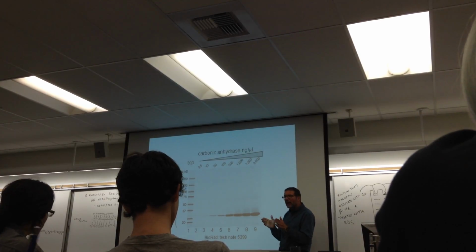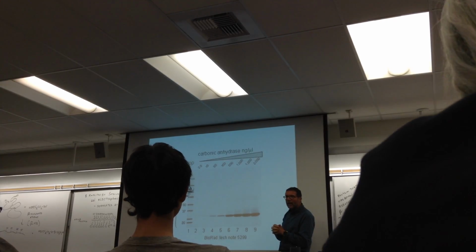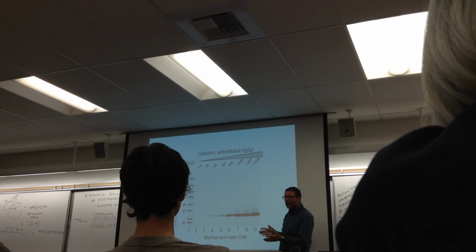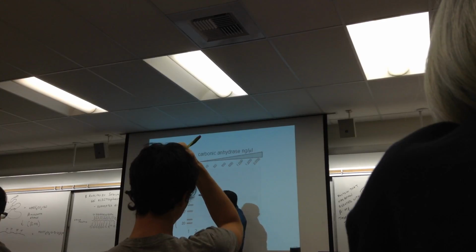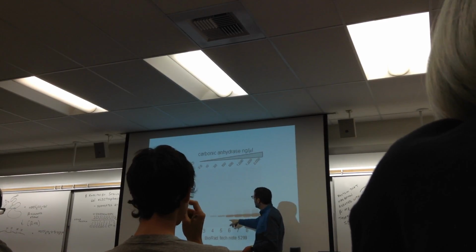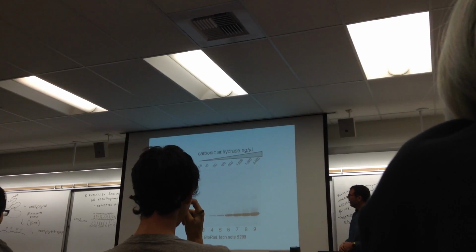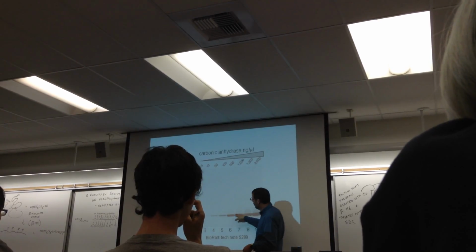And you can adjust the concentration of polyacrylamide to separate out different size ranges. So if you have big proteins, you have a lower percentage of acrylamide. If you have small proteins you're trying to separate, you'll have a higher percentage of acrylamide. And then this is just one particular protein, carbonic anhydrase, where they just added more and more of it. It's got a molecular weight of around, I don't know, 30 or so.